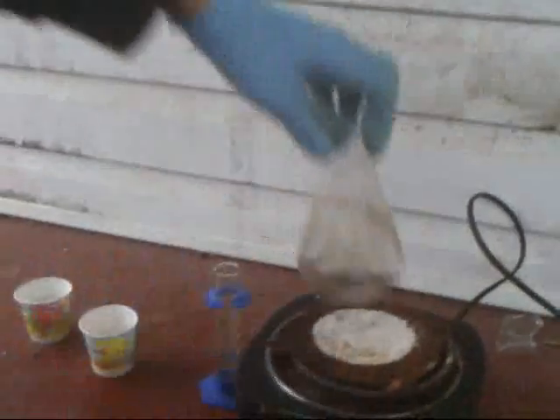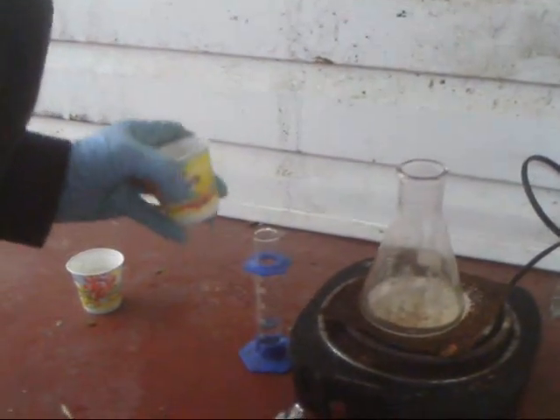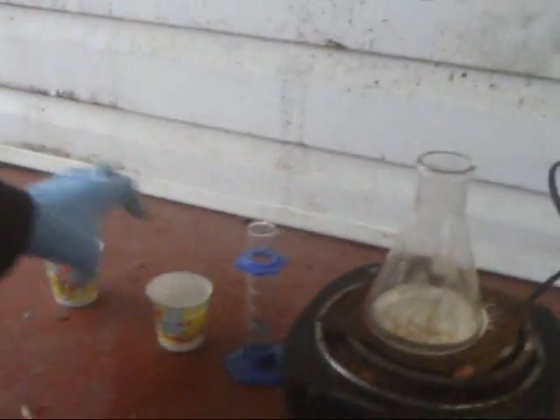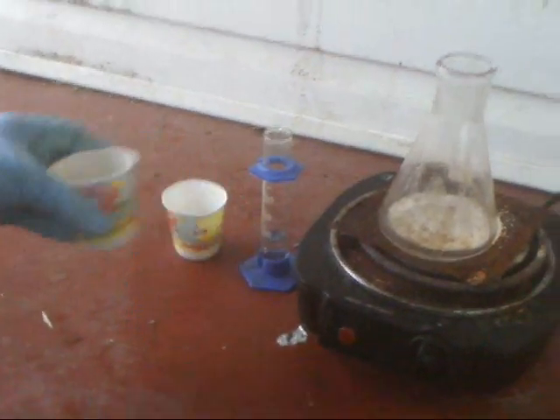What you'll need is a 250 milliliter flask, 10 milliliters of water — which is optional, but I'd recommend using it — 30 grams of sodium chloride, and 70 grams of sodium bisulfate, which is sold as pool pH down. And then you'll need ice water.